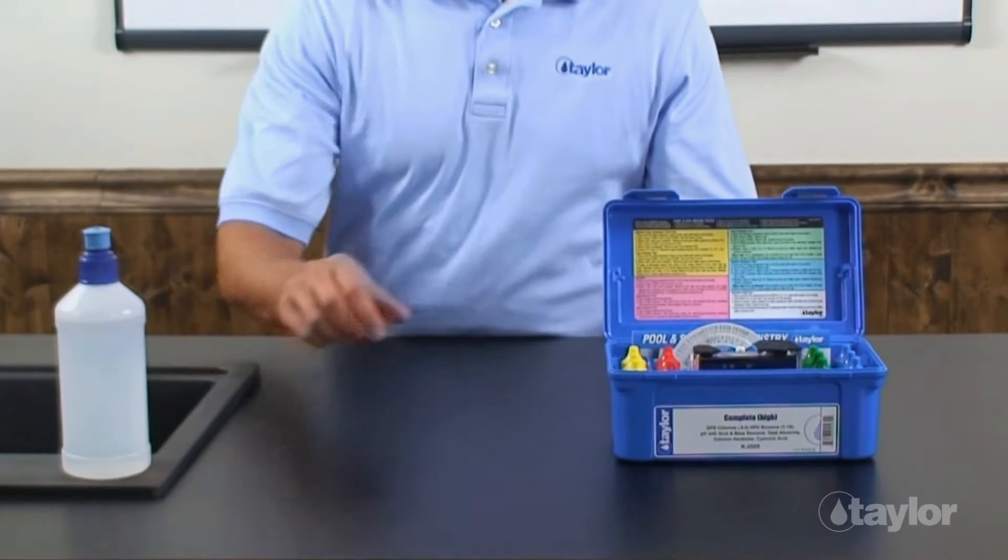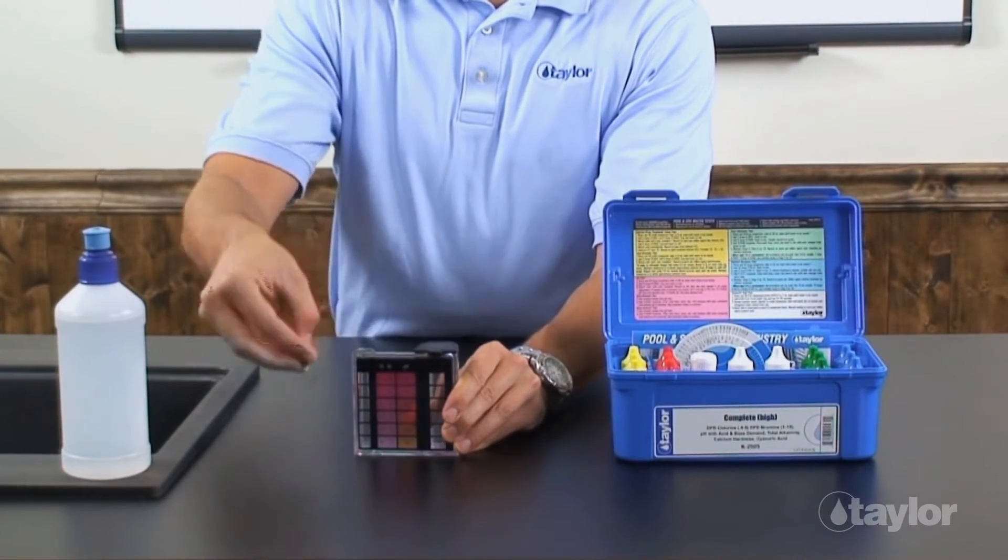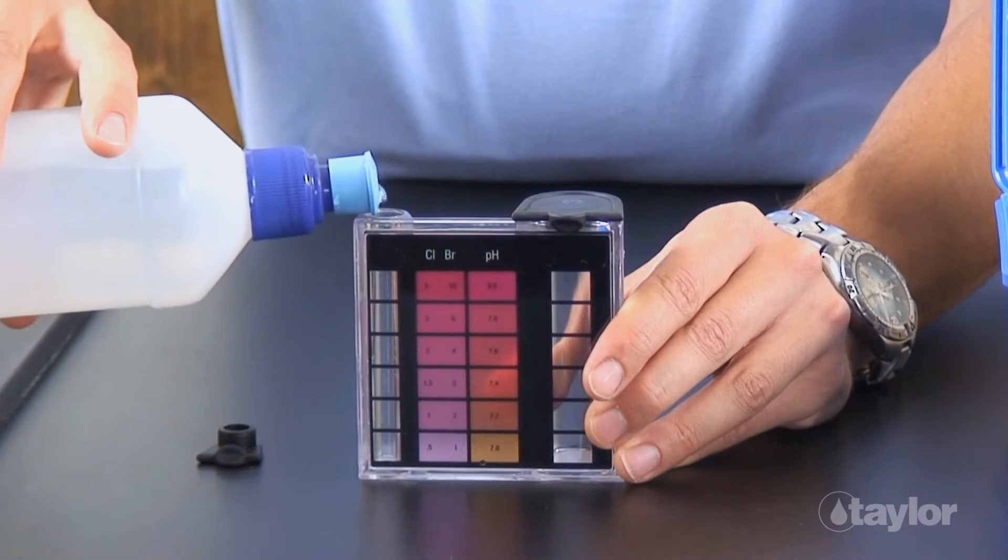When testing either chlorine or bromine, if the color is off scale, repeat the test using a 4.5 mL sample diluted to the 9 mL mark with tap water.